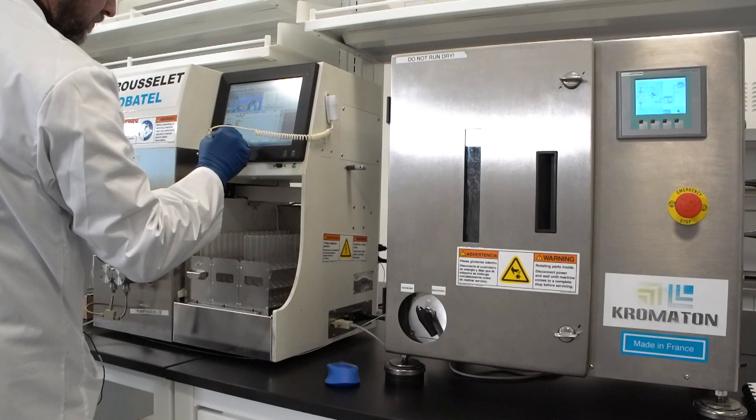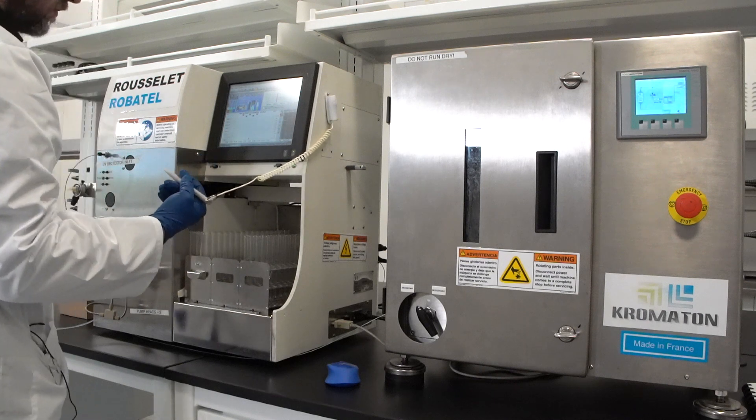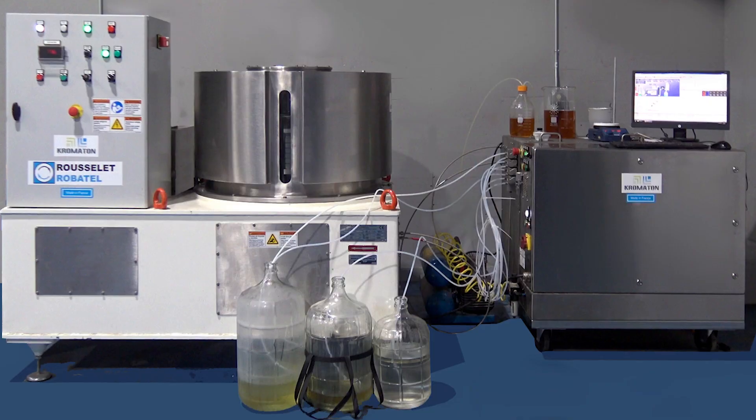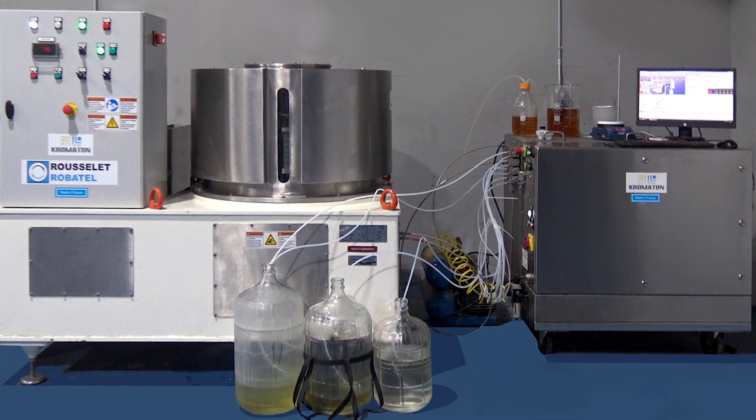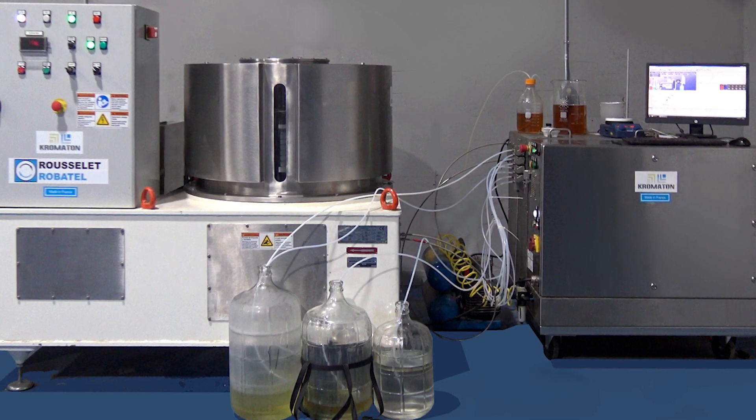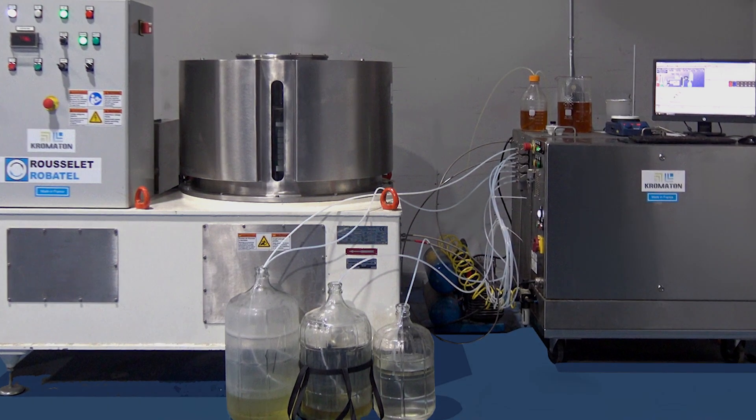The Chromaton CPC is capable of handling difficult liquid-liquid separation from analytical through production scales and simulates hundreds of liquid-liquid extraction stages in series, making the separation of similar and otherwise difficult to separate molecular species possible.